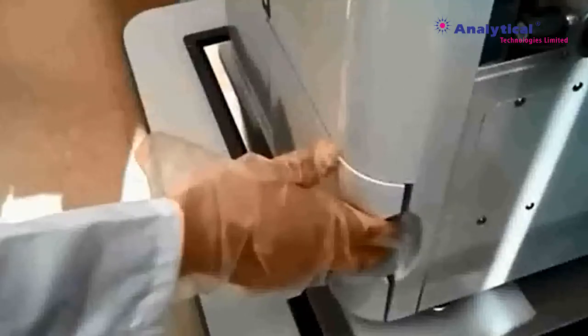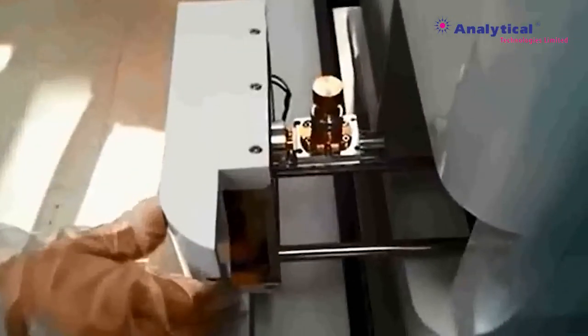After the sample preparation is over, click the vent button to make the chamber to air state. When the chamber door opens, remove the used sample by using the hexagonal wrench. After removal, firmly secure the prepared sample. If it's not firmly secured, observation will be difficult because the image will move.